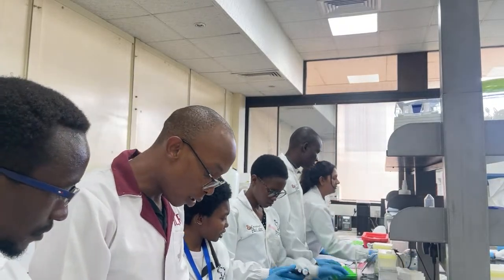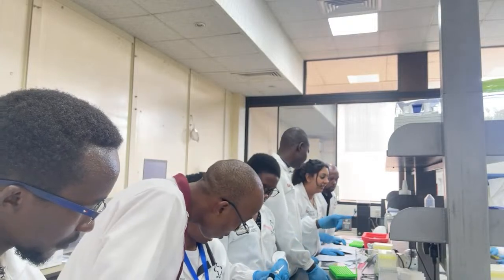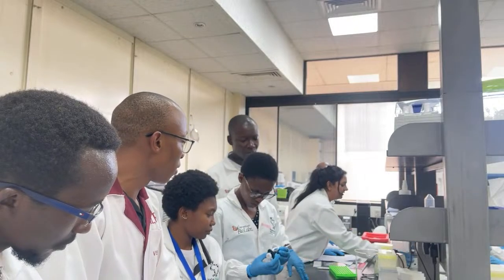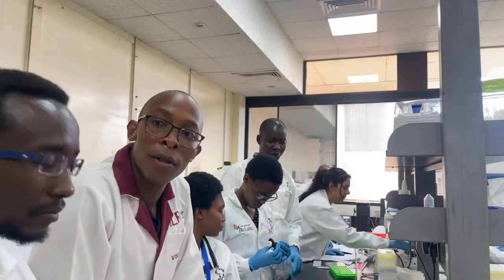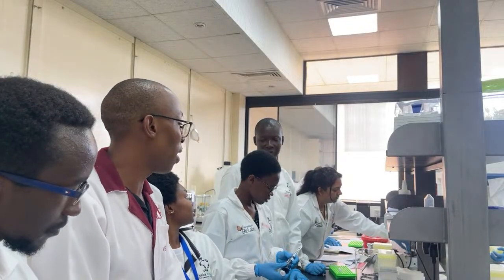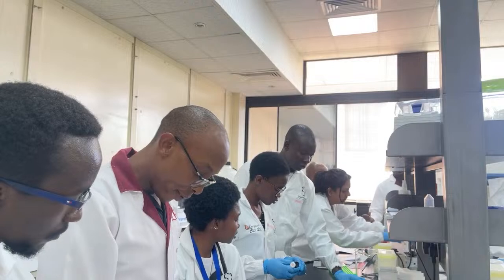So 200 microliters of Buffer SB. 60 microliters. Yeah, 60 microliters of Buffer SB. You need a P200, or P100 if you have it. So we are almost there.